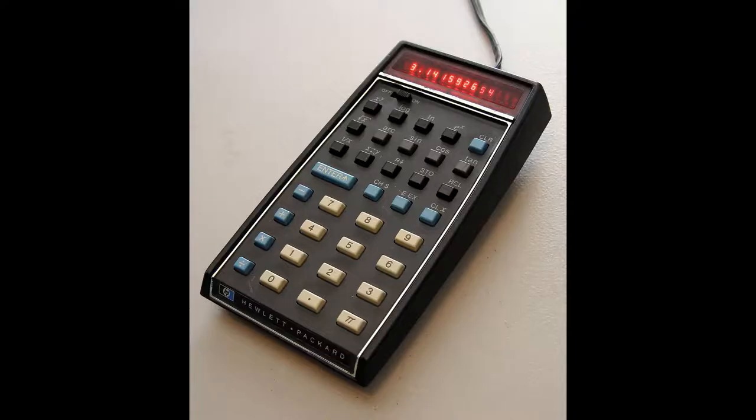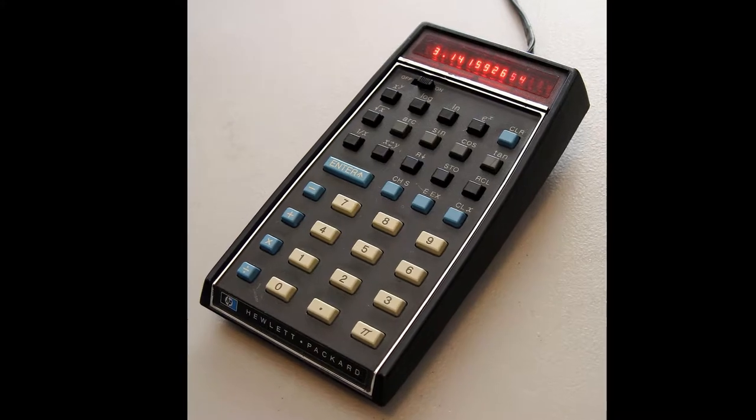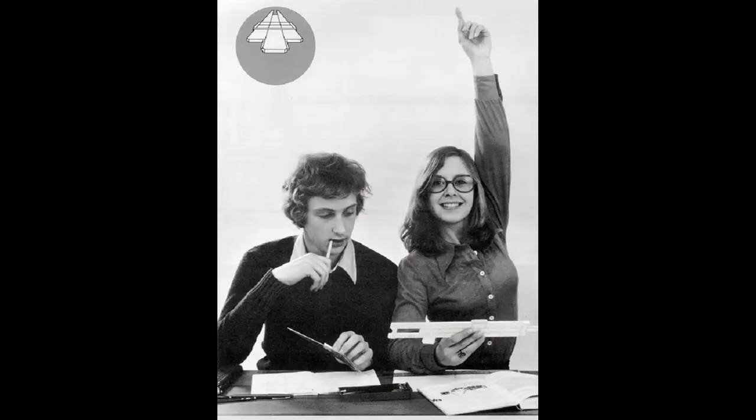If they have, they may have also used a calculator like this, a classic, or even a slide rule.